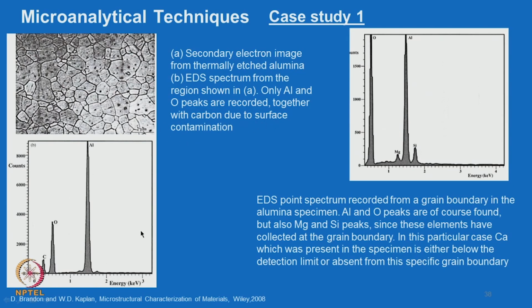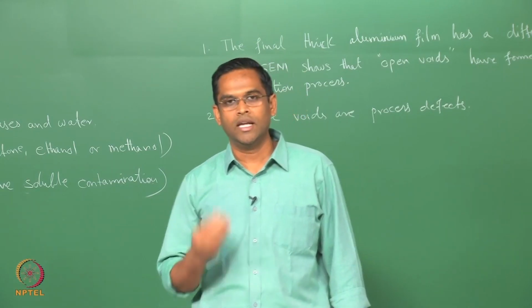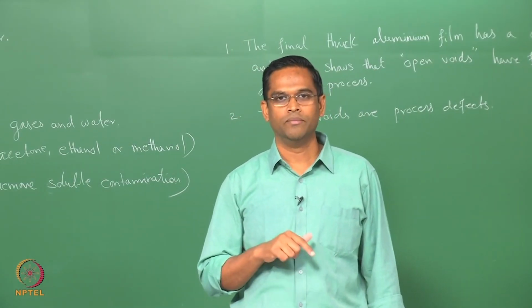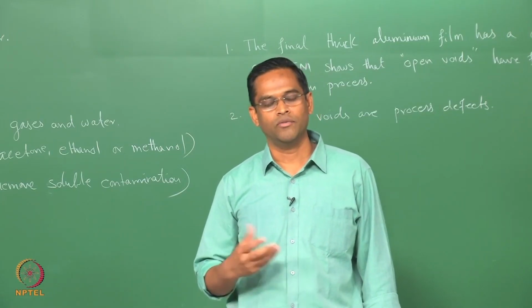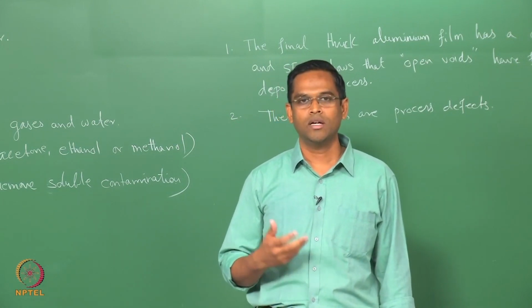Please remember, when you do this microanalysis, you compare with the corresponding theoretical basis I have given in the theory class, where I have clearly shown the detection limit of EDAX, and that clearly shows that in order to obtain any useful information using EDS, you need to have that particular element present in the sample sufficiently beyond the threshold quantity; below that the EDS cannot detect.